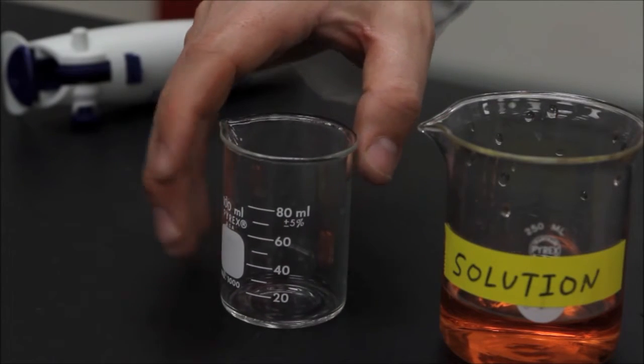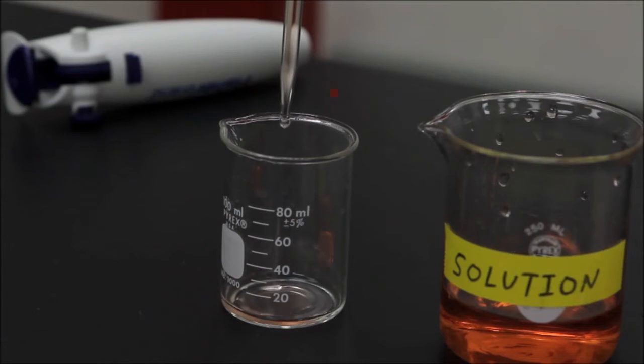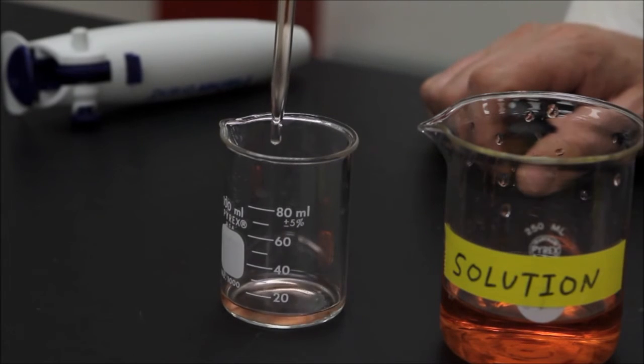Next, hold the pipette over your destination container and release your thumb to allow gravity to drain the liquid. Finally, touch the pipette tip to the inside of the container to dispense any half drops.